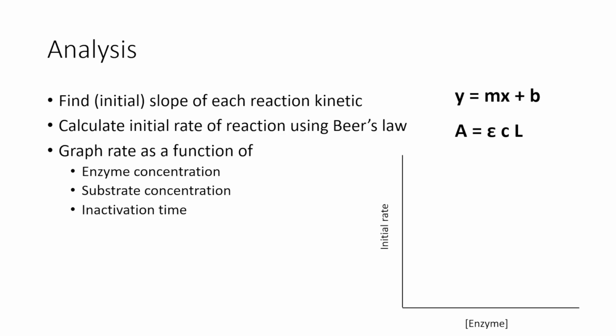So when we looked at our reaction kinetics, we were measuring the absorbance as a function of time. But now we're going to be measuring the reaction rate as a function of the concentration of our enzyme and substrate, as well as time spent with the inactivator.